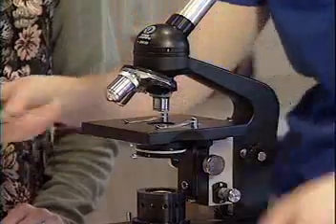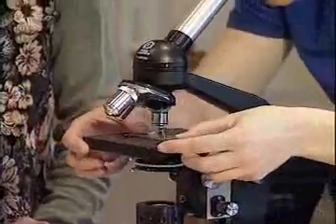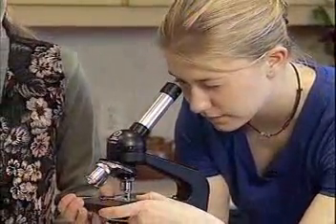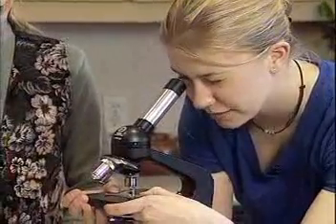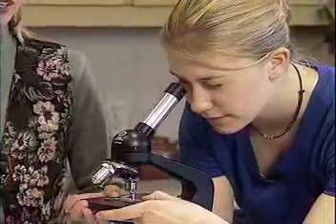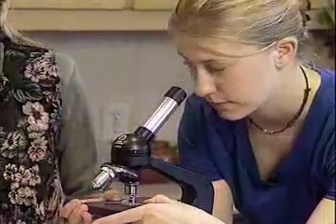Okay. What do you see? Just a smear. I don't see anything distinctly. Oh, the cells are there all right. They just need highlighting. You have to add a stain.